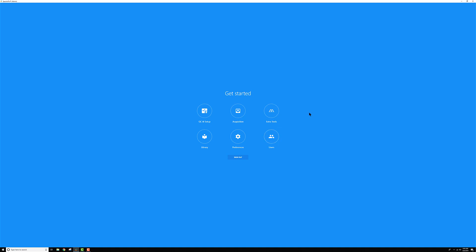Once you're in, you'll come to this landing page and you can see there's six different modules. There's a QC and setup module, which is where you would go to QC your instrument every day and monitor the performance based on that QC over time to make sure your instrument is healthy.